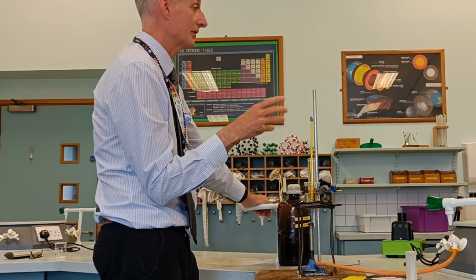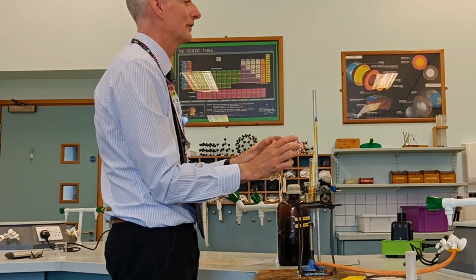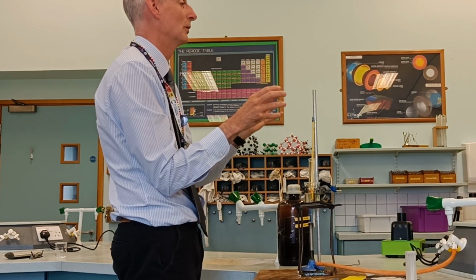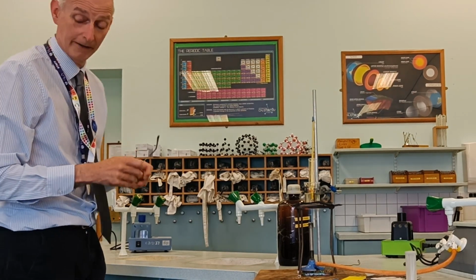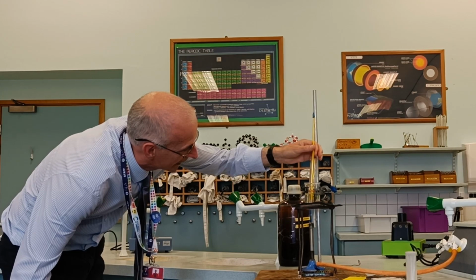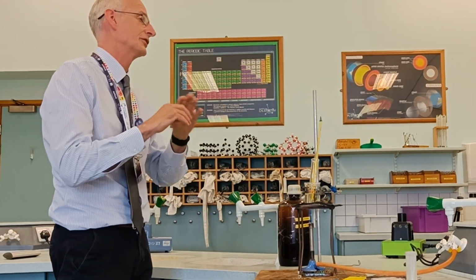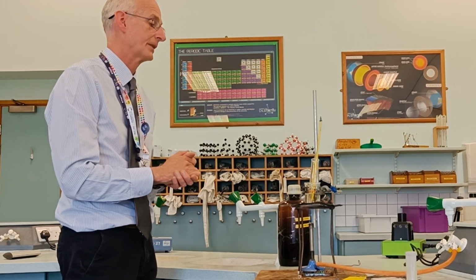It's quite a tiny little sample, but the beauty of doing it in these curved beakers and this curved boiling tube is that it has a magnifying effect on the visuals, so it's a bit easier to see when it melts. So I'm going to keep an eye on it and see when that white powder in the bottom disappears from view and turns into liquid. White crystals turn into colourless liquids. It really is a clear change.